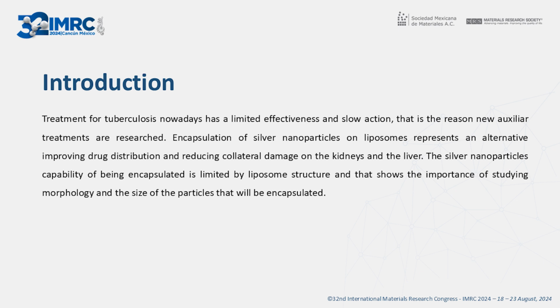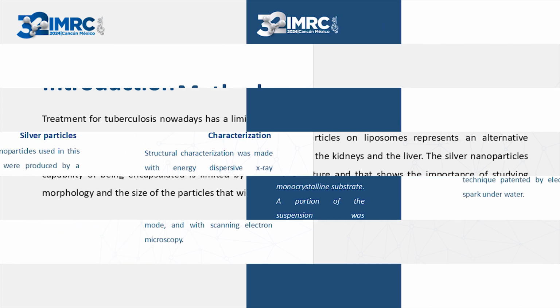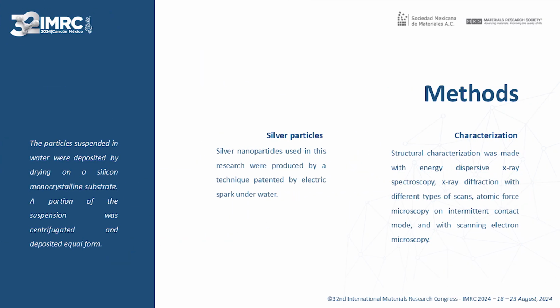Liposome structures limit the size of silver nanoparticles that can be encapsulated. This is the reason to research the morphology and size of the particles that will be encapsulated. The silver nanoparticles used in this research were produced and given to us by colleagues of Taras Shevchenko Ukraine National University. The particles were produced by a patented technique using electric spark underwater.